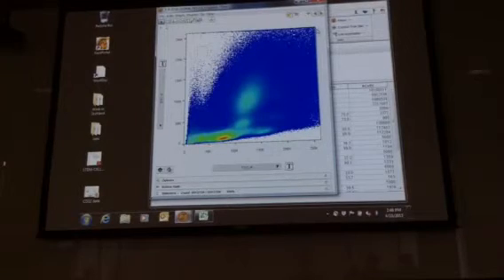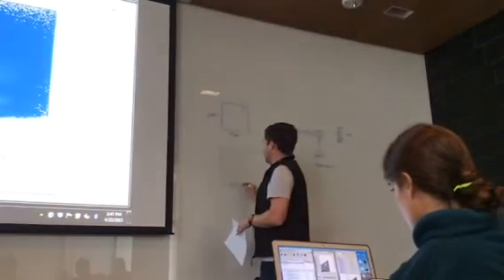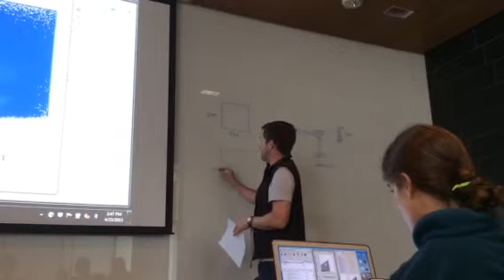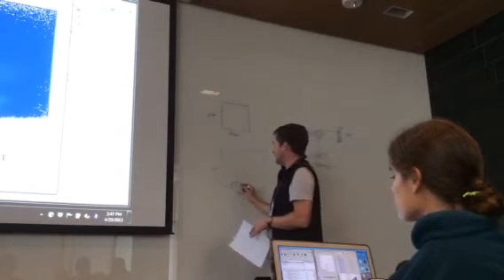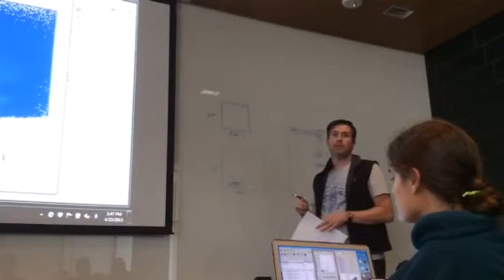You guys know all the different cells of the hematopoietic system, like for example, lymphocytes. Lymphocytes have a large nucleus, they don't have very much cytoplasm, and they're small and round. So if this is forward scatter, this is size, this is granularity, they have very low granularity and are fairly small, so your lymphocyte population would be down here.